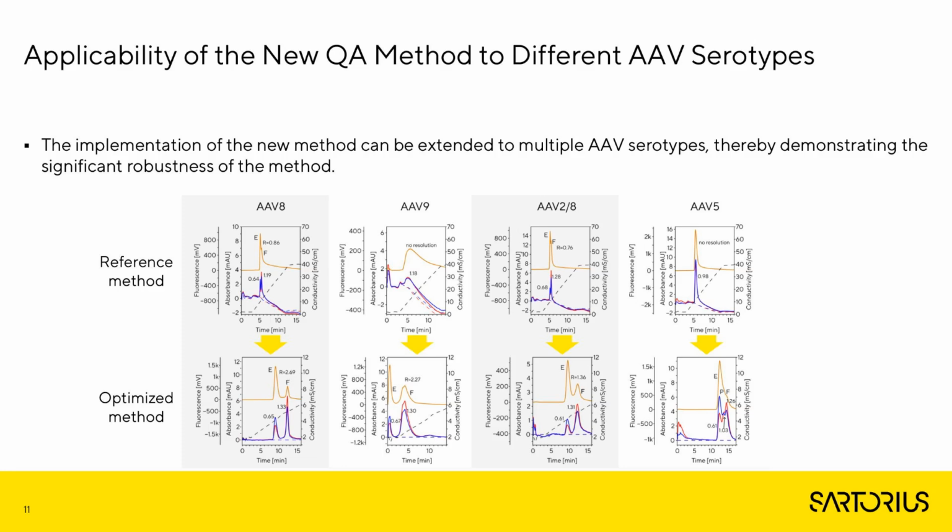We see that another population of AAV full capsids is present in the sample, and we know that the AAV9 serotype has the most PTMs, which probably reflects in this heterogeneity of full capsids.